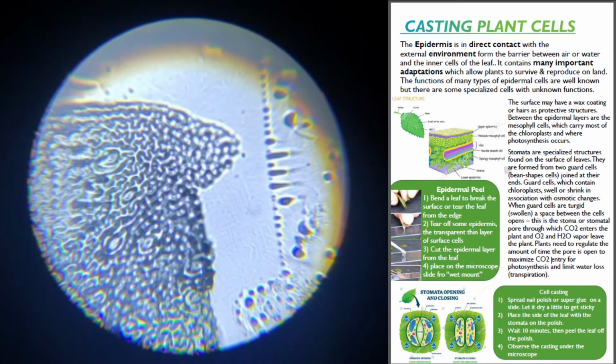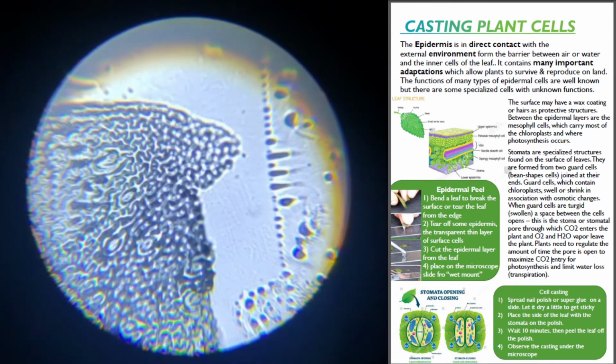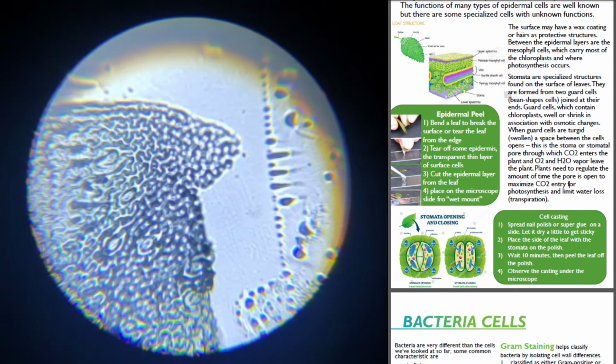So looking over here, here are your stomata. There's the opening right there, the stomata, right here. There we go. Oh, it's going to keep doing it. Slide that up a little bit. Right there. So there's the stomata. Here are the guard cells.